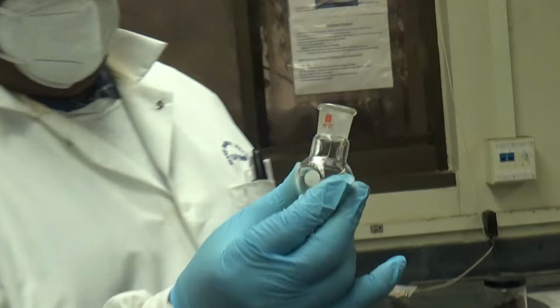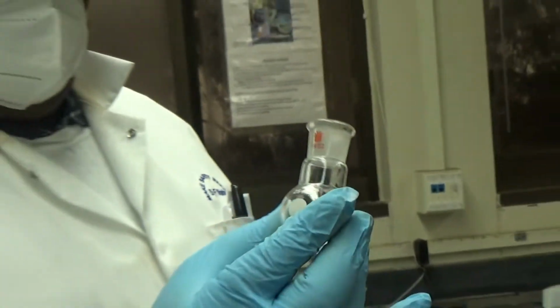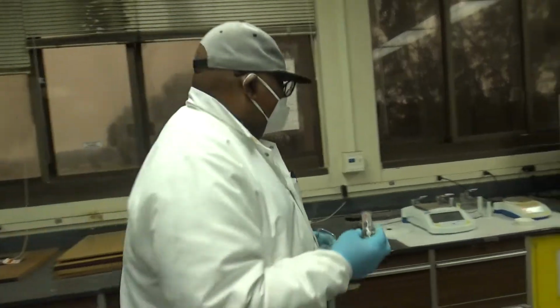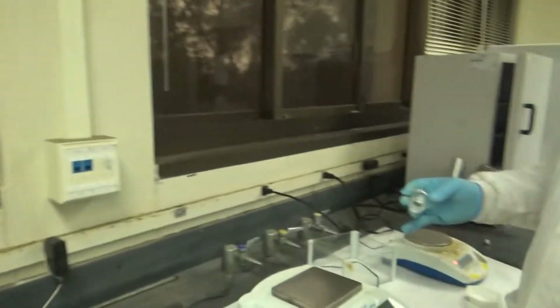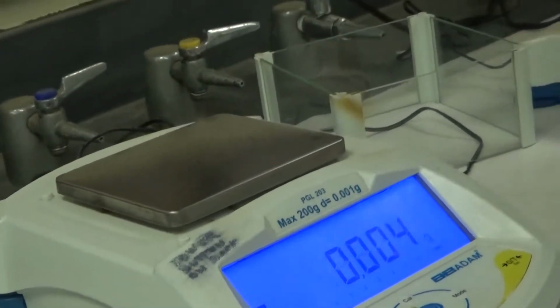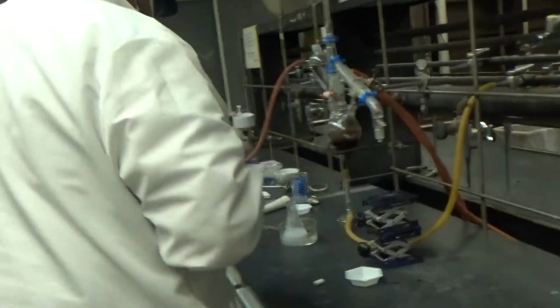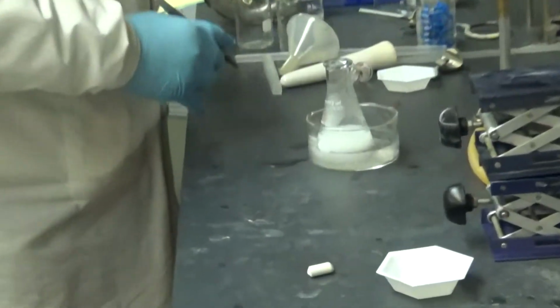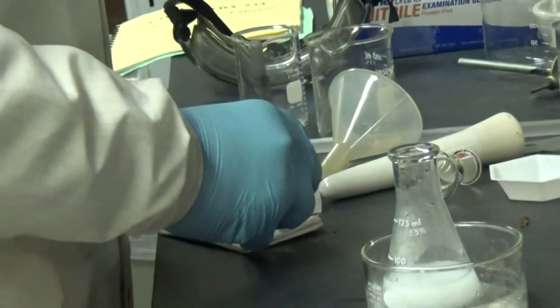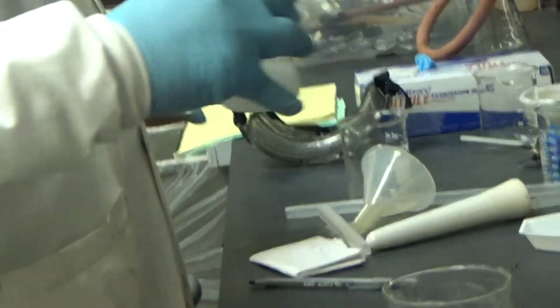Okay, so you need a 25 milliliter round bottom flask that has to be cleaned and tared. That means you need to take the weight of an empty round bottom flask. It's already clean, so you just put it on the balance, which is already at zero. It reads 42.590. That's the tare weight, the empty flask weight. Now I put that back here, and you go to the hood.